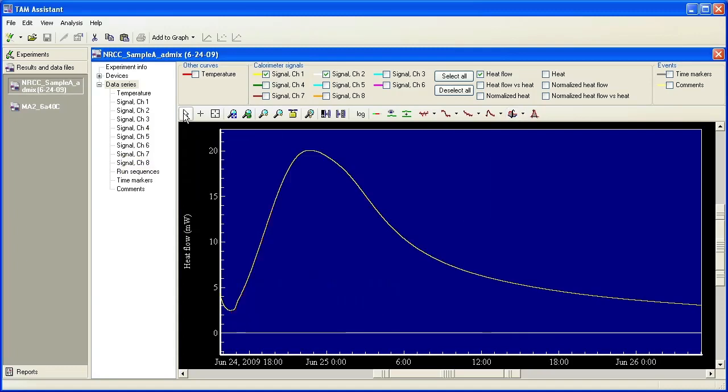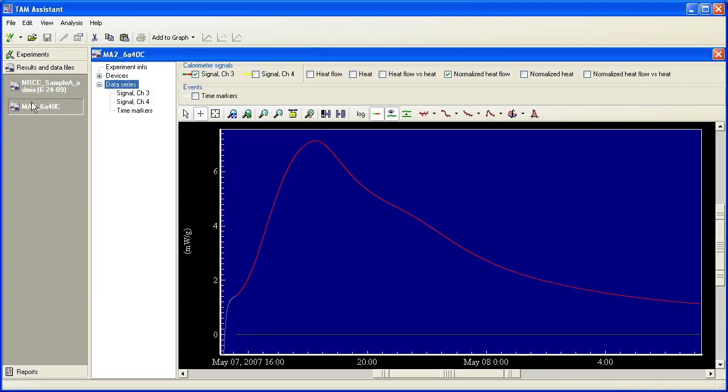But here, since we're in results, we can just clear it immediately after clicking. There's another way to integrate, but I'm going to go to another file to show you.